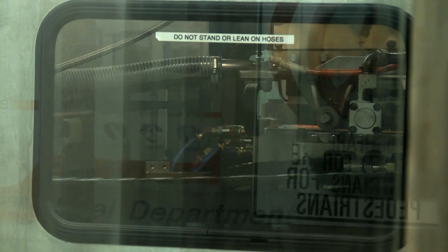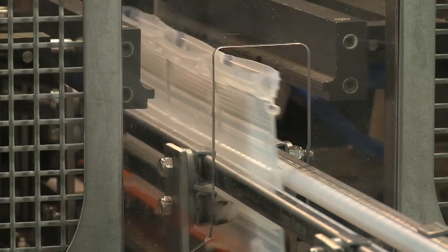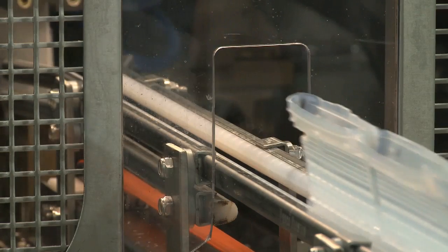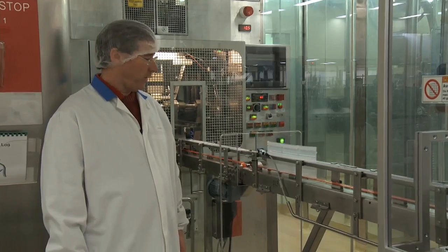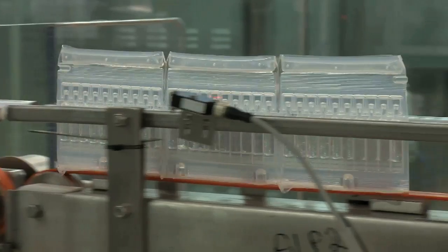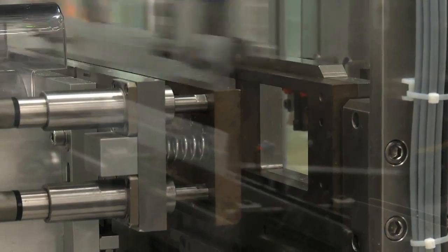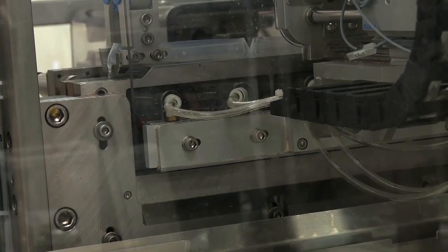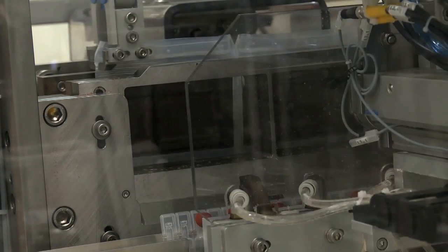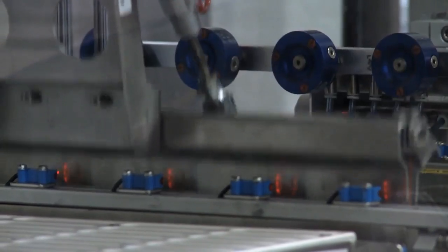We blow plastic bottles in a sterile environment, then fill them with the sterile liquid and seal them before passing them into a non-sterile packaging area where we pack them into a blister pack. So the plastic bottles, after they've been filled and sealed, pass from the sterile area into our packaging area. The bottles pass along the conveyor and into the deflash machine, which cuts off the excess plastic and separates the bottles before they pass on to the packaging area.